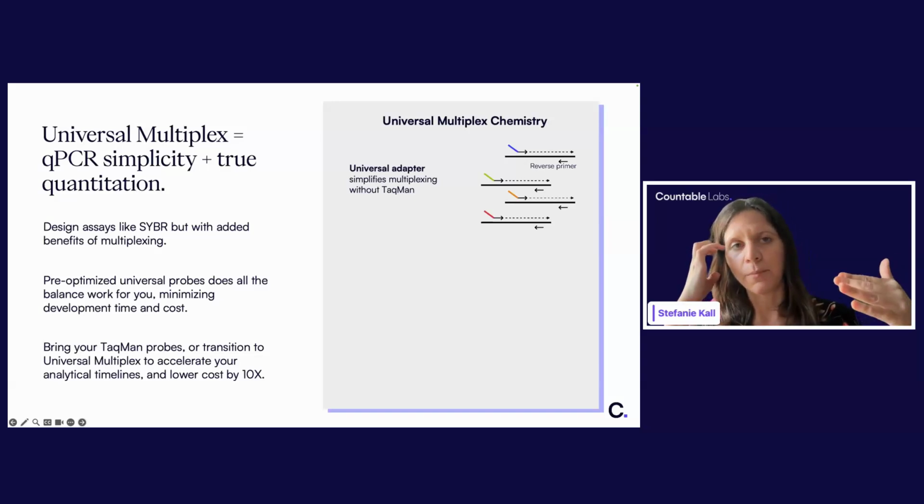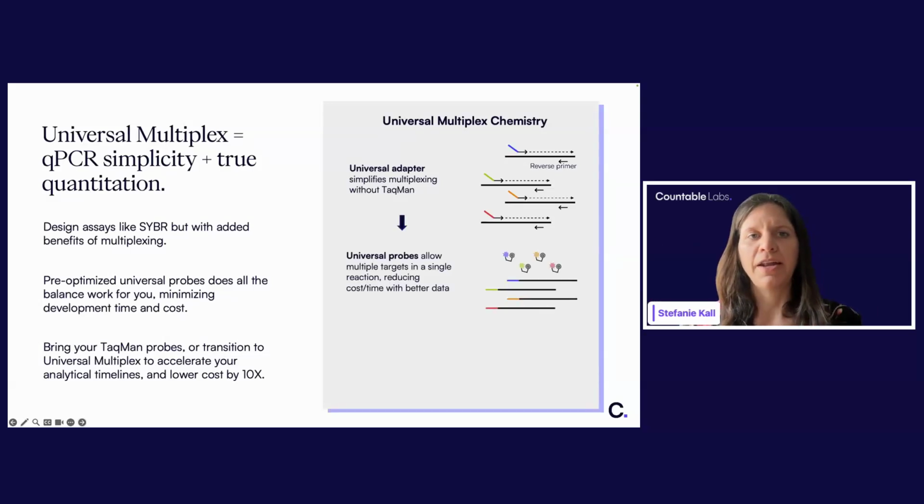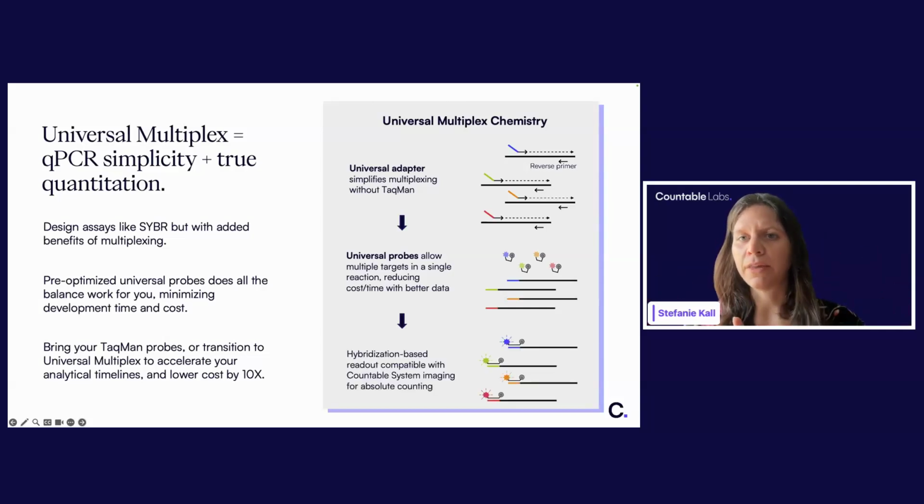And it goes on your forward primer as a leader sequence, basically, to whatever the rest of your forward primer sequence is. You buy a typical reverse primer. And now as that amplifies, that leader sequence gets tagged onto your amplification product. And the probes that are floating around, they bind only with that leader sequence.